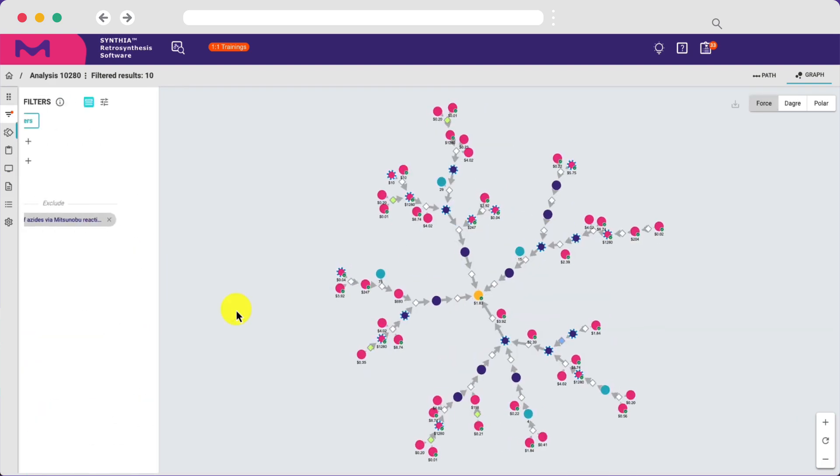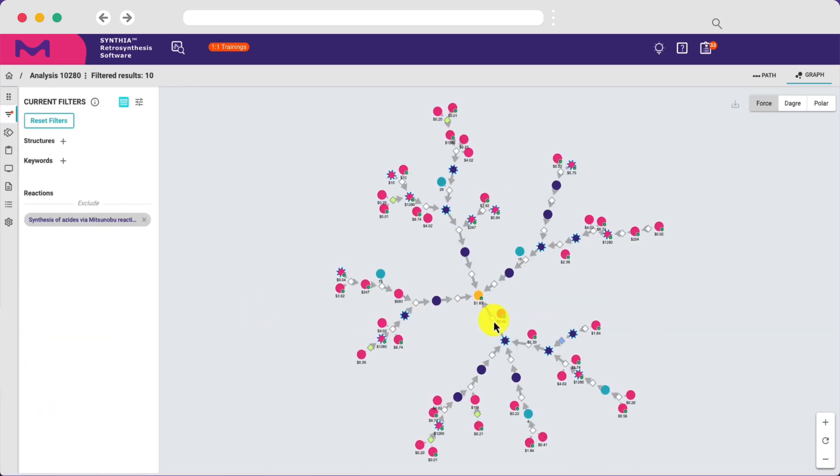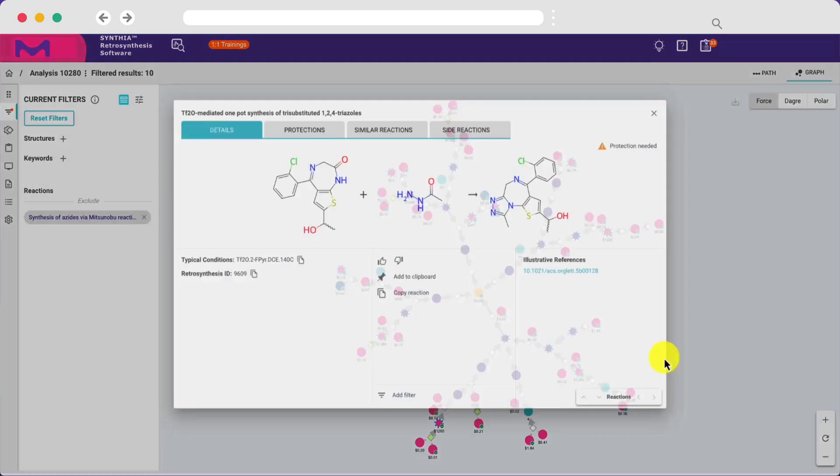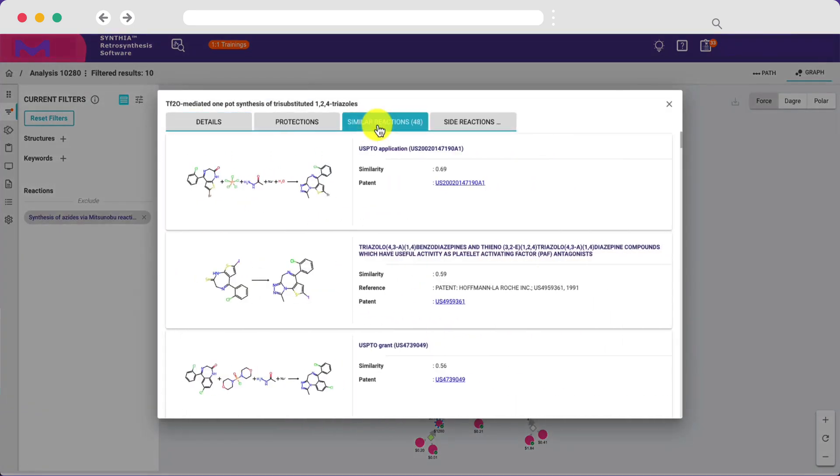Each proposed reaction includes details on the typical reaction conditions and illustrative references, as well as links to similar published reactions.